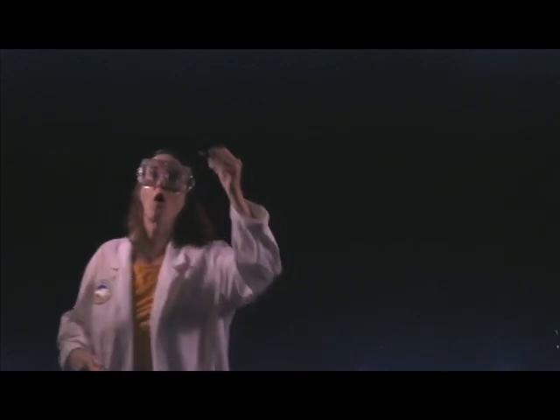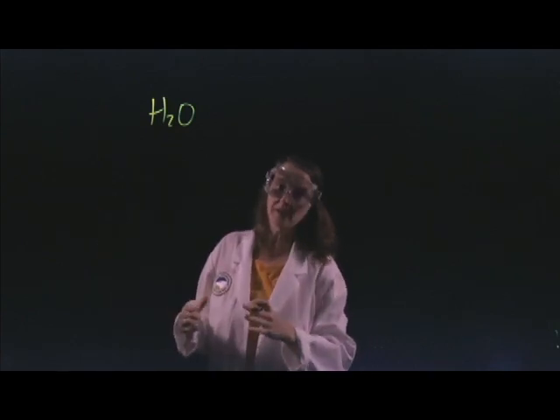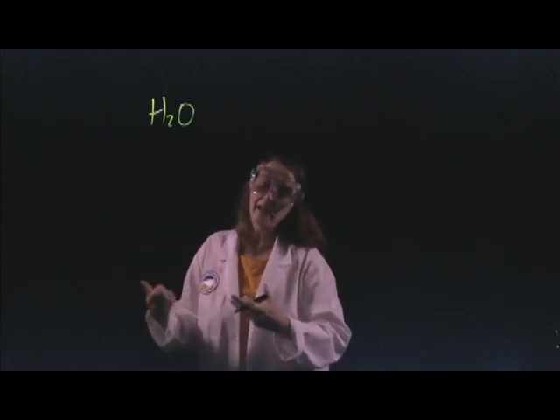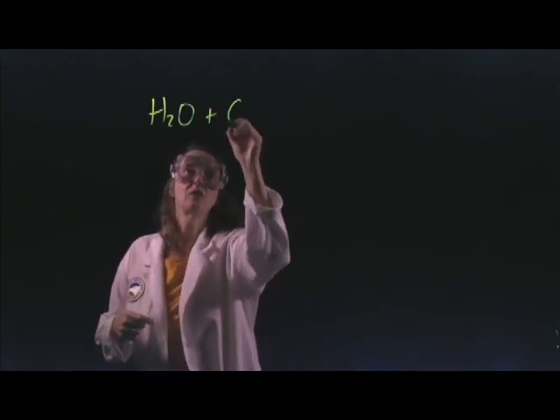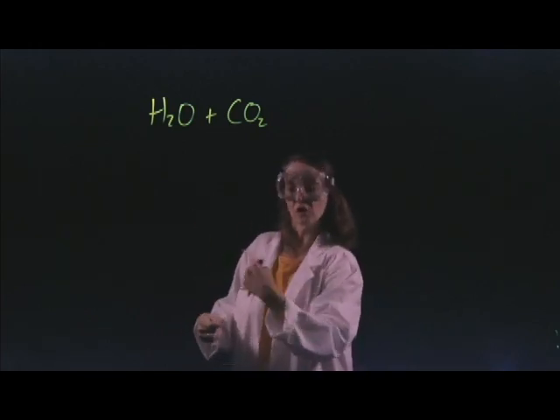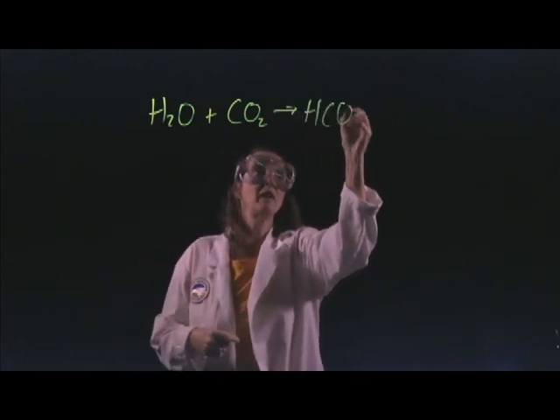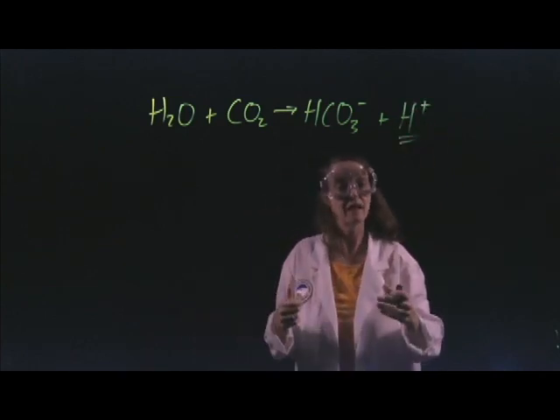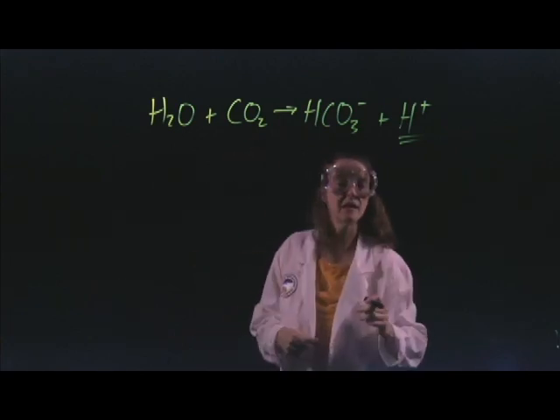You're going to start out with just water. And we know that plain pure water with nothing dissolved in it should have a pH of 7. But water that's in air actually has a slightly acidic pH. Let's think about that here at first. Carbon dioxide from the air can dissolve in water, especially when you're stirring the water. You're essentially stirring air into the water, and you can generate a little bit of bicarbonate ion and hydrogen ion, thus making the solution slightly acidic. So when you set up everything at the beginning, you're probably going to see a slightly acidic pH.